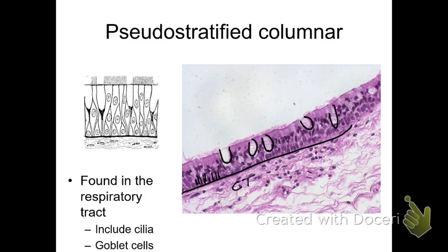And one important feature found in this tissue, on the apical surface, you can see these cilia. Cilia are apical extensions found on the tissue, and this tissue is what is found in your nasal passages and going down your trachea. And those cilia are there to catch particulates. So as you breathe in, and as the air goes down into your trachea, heading to your lungs, it's important that the tissues pull away pollen and particulates and allergens and dust particles.